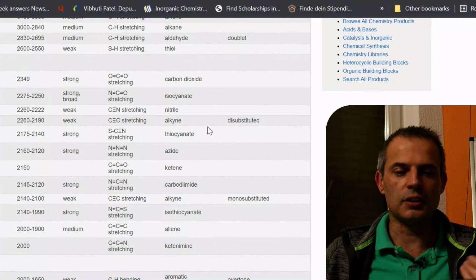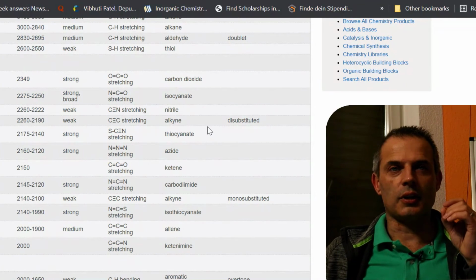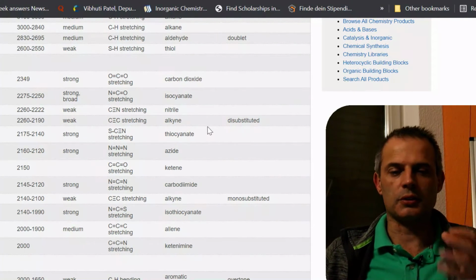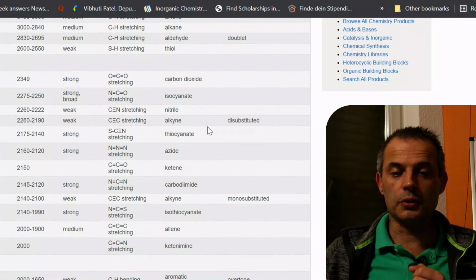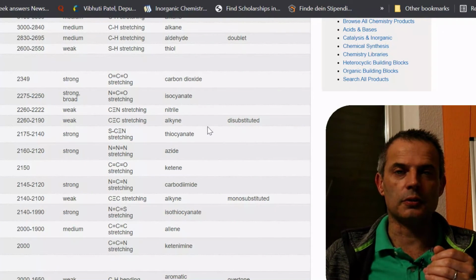So we can see this peak upside down very often. It's good to know where that is. It's also helpful to check that our spectrometer is doing what it's supposed to be doing, because it should always be in the same place. If we do want to measure something that's in the same place as carbon dioxide, we obviously have to be careful about keeping the atmosphere constant.